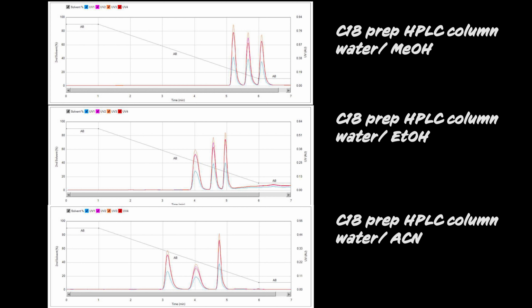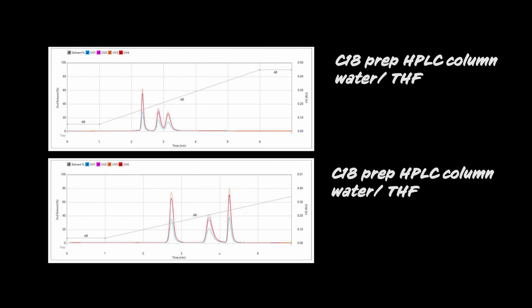As ethanol and ACN have completely different properties in terms of dipole character and hydrogen bonding acceptor-donor ability, it is not possible to make general statements about which solvent is preferable. It always depends on the application and must be determined on an individual basis.